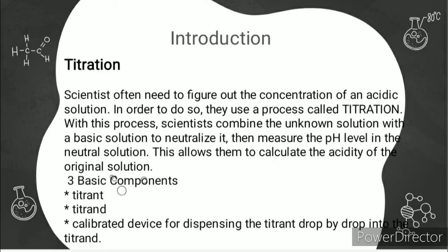There are three basic components. The first one is a titrant. A titrant is a solution of known concentration that is added. It is also known as the standard solution. A standard solution means a solution of known concentration of an element or substance.